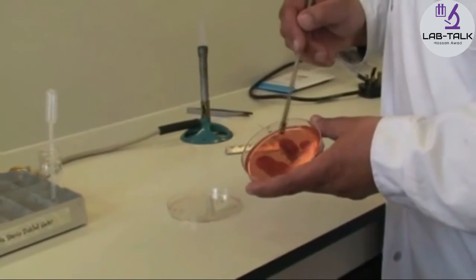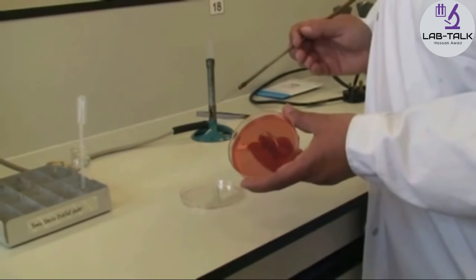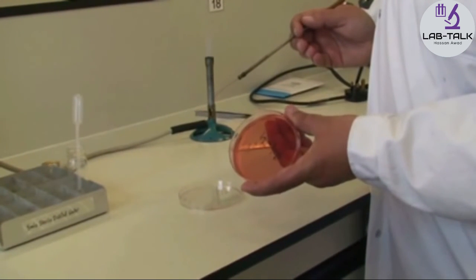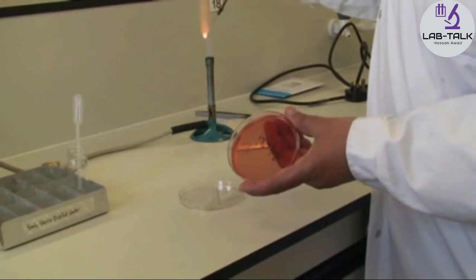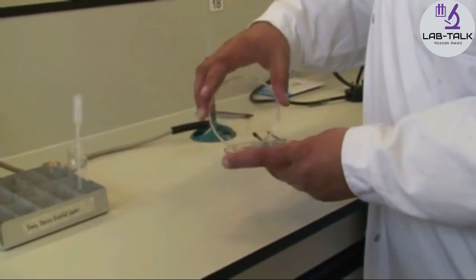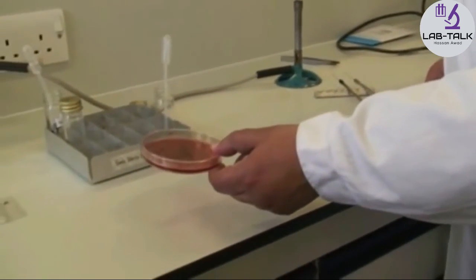For the last one, do a squiggle so you can see those nice single colonies next time. Flame your bacteriological loop when you're finished, pop the lid back on, and the plate along with the API strip will be incubated.